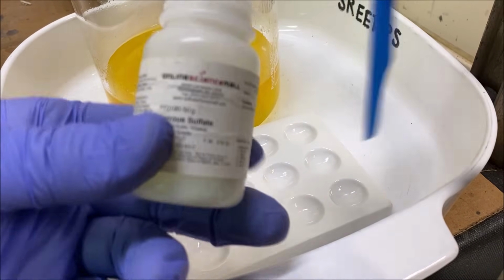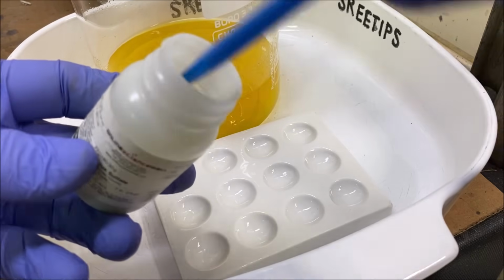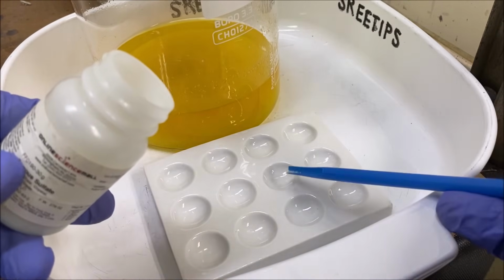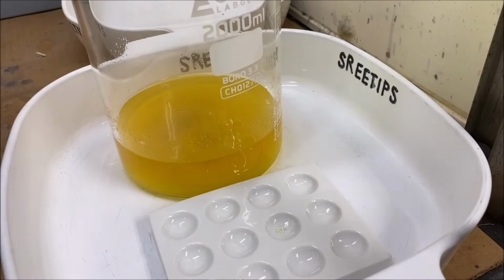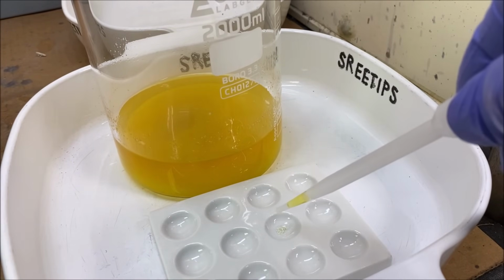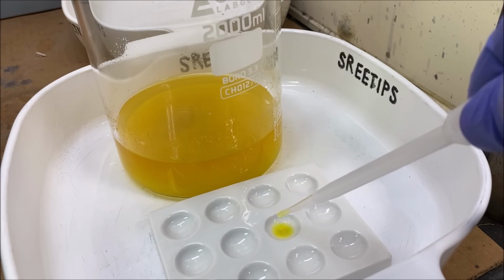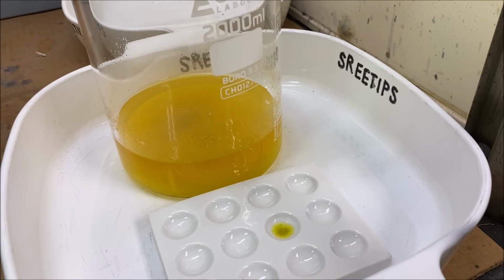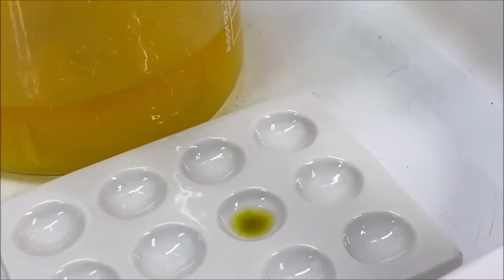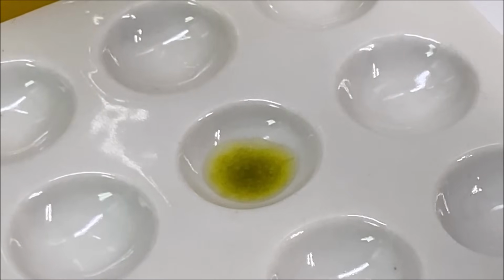Some ferrous sulfate. Put a few of these crystals in one of these spot plate cavities. Just a smidge of this. Drop it on this ferrous sulfate. If it turns brown, then that means we got gold in solution. Just like that. That's verification that we've got gold in solution.